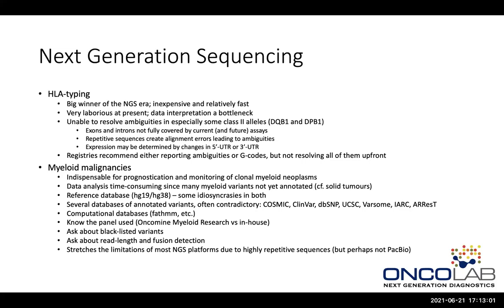PacBio is a platform that is not widely available in South Africa. It uses a specific technology that goes for far longer read lengths, in the kilobases, up to 80 or 100 kilobase reads, but it is not widely available in South Africa.